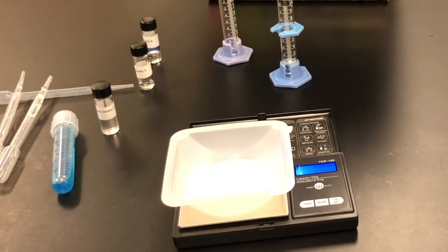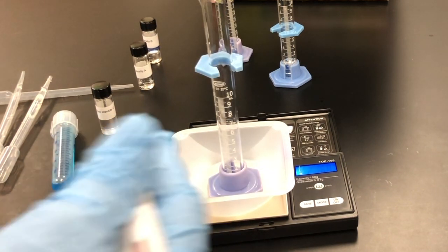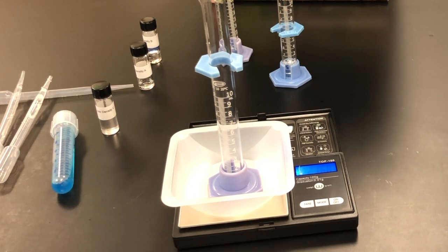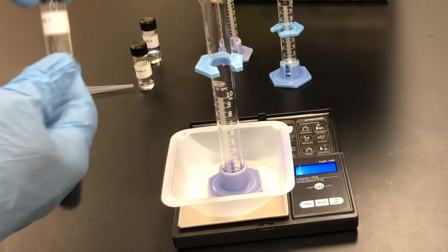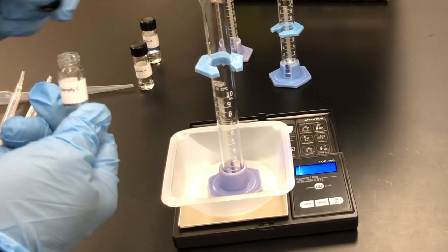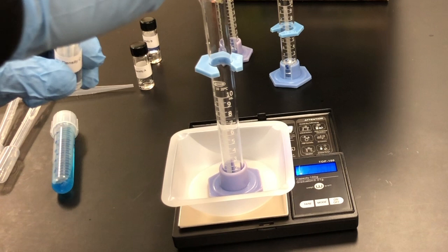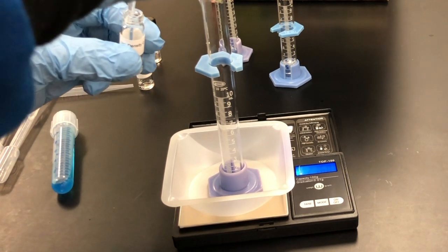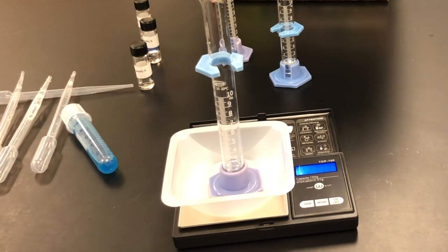and then pour it into a second test tube. I'm going to put the third graduated cylinder onto the scale. I'm going to read the mass, and then I'm going to take a new Beral pipette, open up liquid C, and again do the same thing. I'm going to draw some liquid C out, put it into the graduated cylinder, wait for the scale to settle down, and then read the mass.